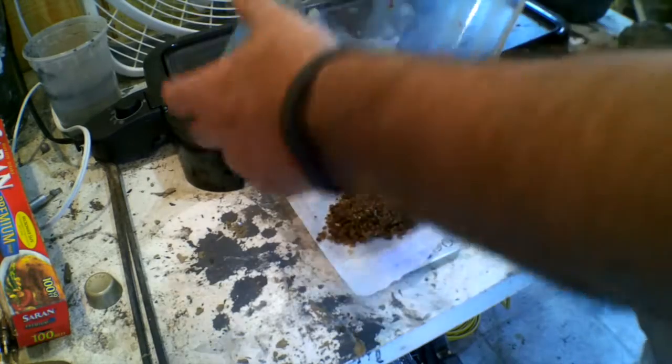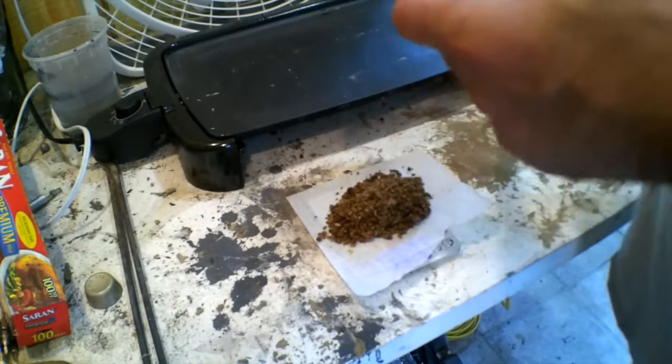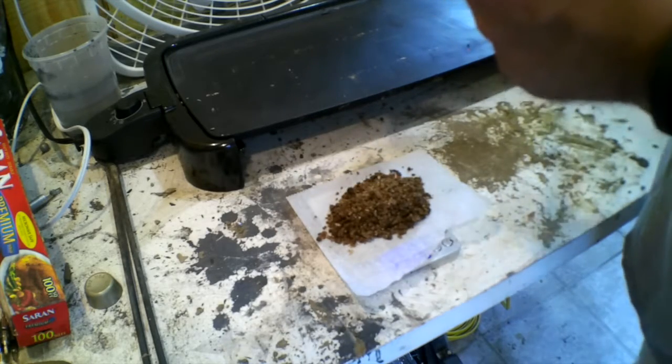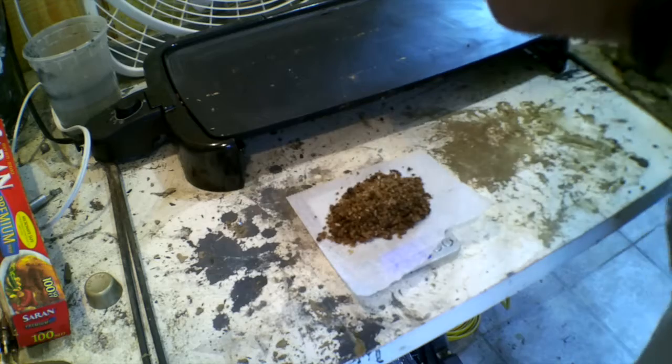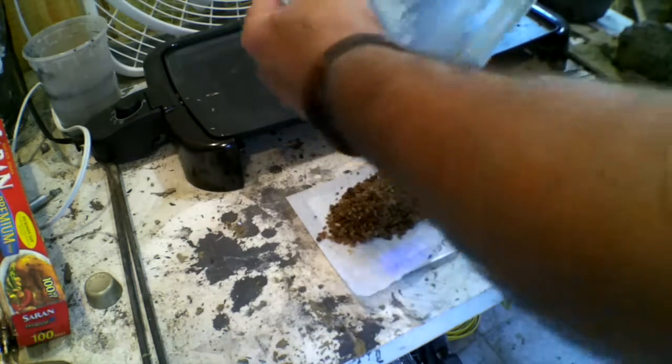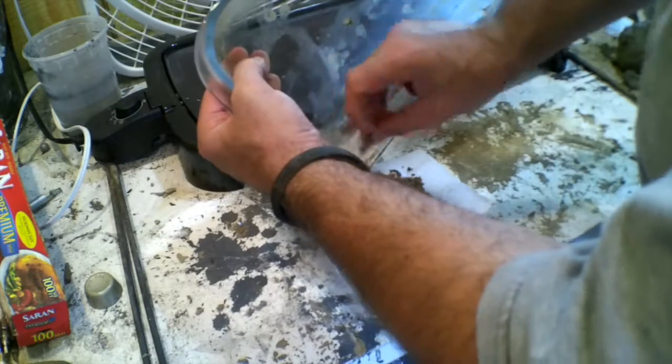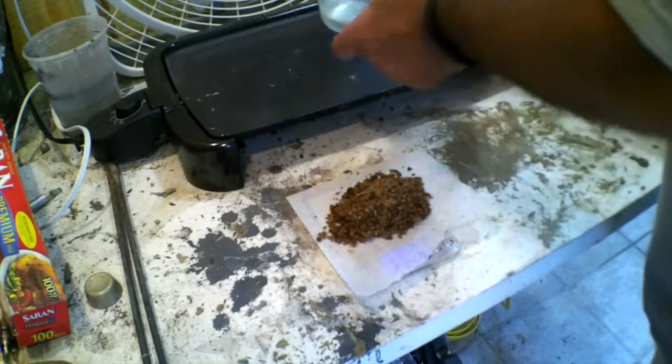273 grams. It's obviously contaminated because it's brown. And I don't think it's really dry. Apparently potassium carbonate is very hygroscopic, and I'm just not sure that I've got a true weight.